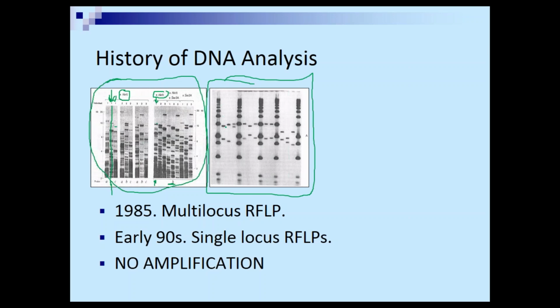And that area of DNA, since everybody has 2 copies of DNA in their genome, do we remember that from part 1? It would have 2 bands. One band came from your mother and one band came from your father. And again, every time you smeared out my DNA and visualized it with this probe, 2 bands would form, and they would always be in the exact same place.